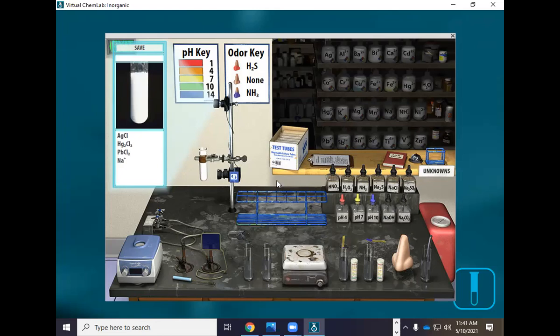Okay, if it asks you to click on the centrifuge, you would leave whatever test tube is in here. Here's the centrifuge. So you click on that. And you can see this is what a centrifuge looks like. So that's when you click on the centrifuge. So those are pretty much how to use it. You click on here for the centrifuge.